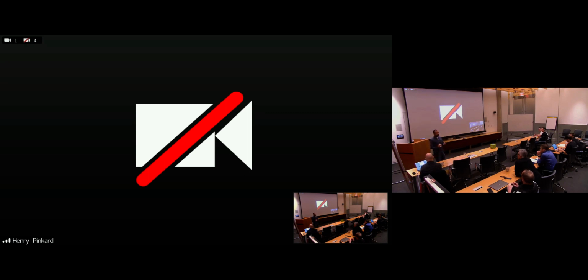And as I was thinking about what we would need in this next generation control software, the things that we value in the scopes that we build are a few things, right? So we need very good timing control, and I think LabVIEW does a good job in those regards. So we need timing that is very precise in the millisecond range, and latency that is microseconds.